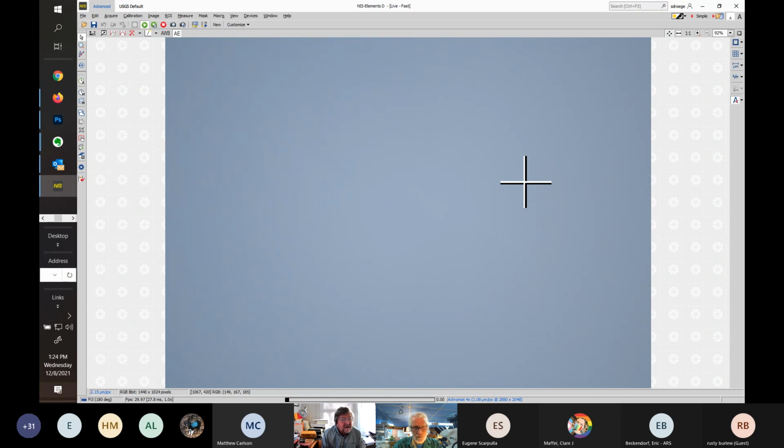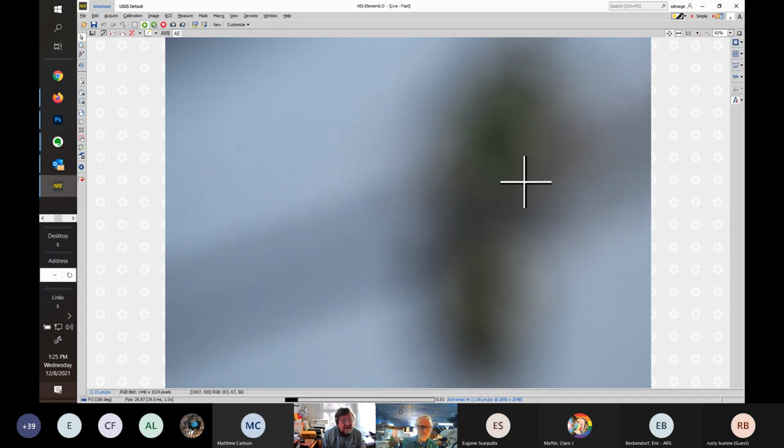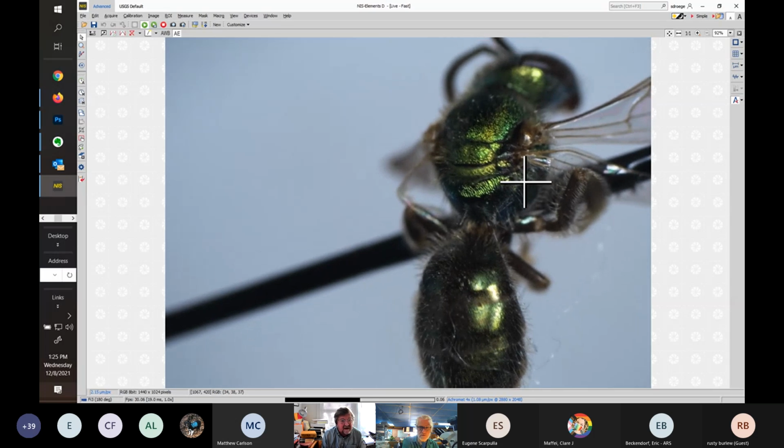Mike, you're more precise. I agree, but I often do use either my eyepiece micrometer or a reticle just to convince myself. After a while looking at these, you start thinking, well, do I really know what I'm doing, am I in outer space? So every now and then I do take measurements just to convince myself that I'm not losing it. But in general, like Sam said, if you had to measure every Augochlorella, you'd never finish. So you're eyeballing it, and once you see enough of them, it's pretty straightforward. The same thing's going to happen when we talk about persimilis versus aurata, which is coming up here.